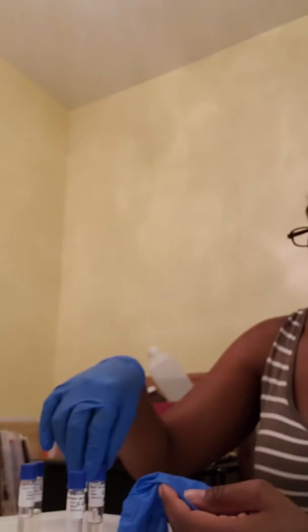And just to give you a little background on pH balances, 7 I would say is the average, or is what is notated to be the average. The lower the number, the higher the concentration of the acidic level. And so I have 3 tubes each.